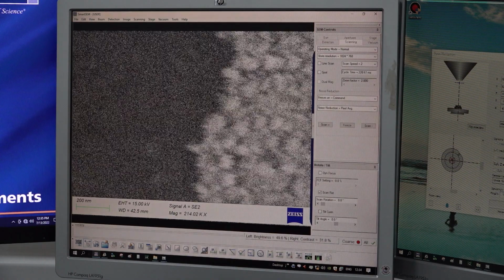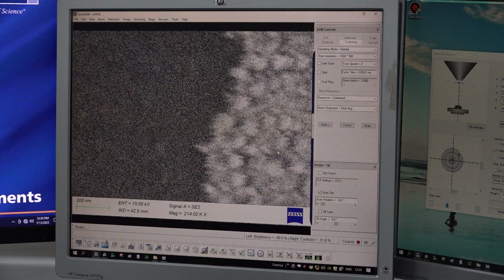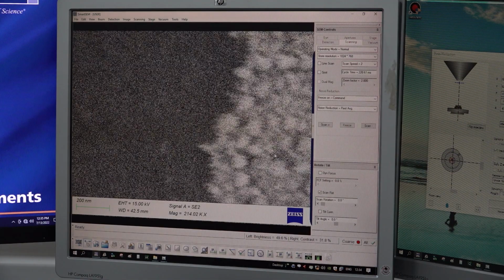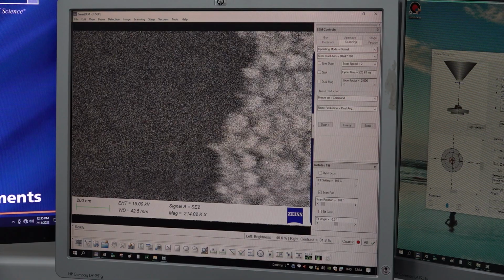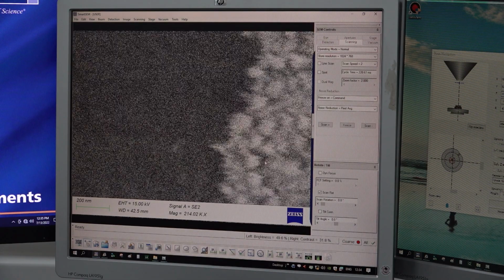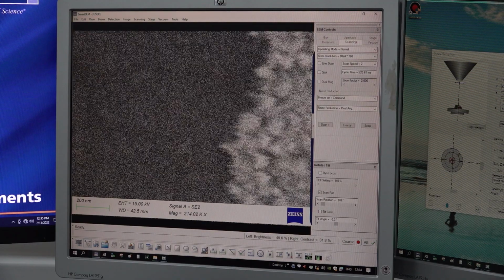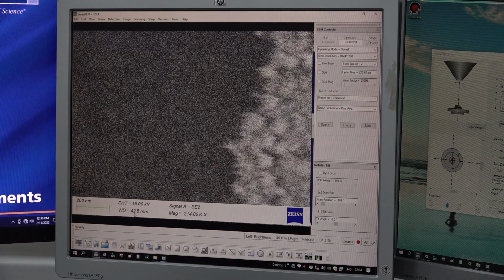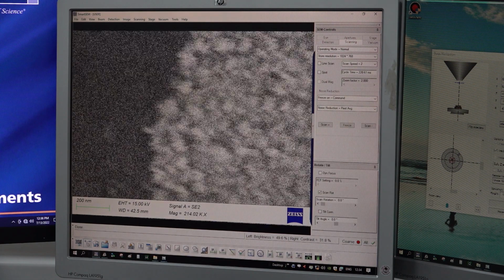Similarly, for the ASB detector or HD ASB detector or backscattered electron detector, you should be between 3 to 5 mm in the in-lens mode itself. Finally, if you are doing EDS, you should be in the range of 8.5 to 9 mm. Please note that it should be in a focused condition. Whatever working distance you are seeing here, unless the image is focused, it is not correct.